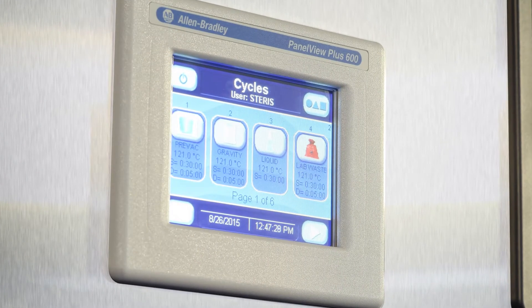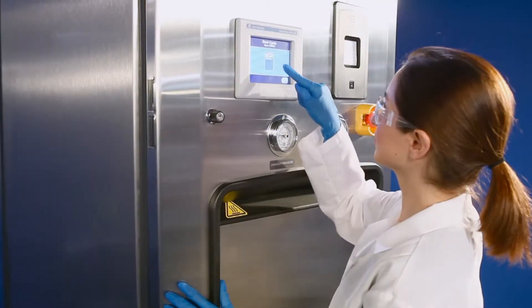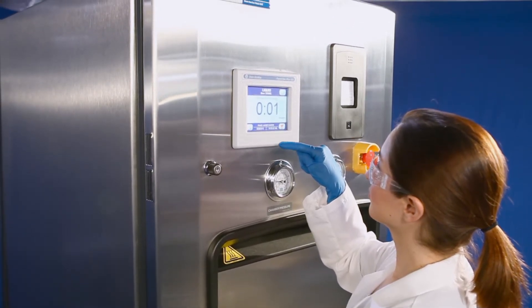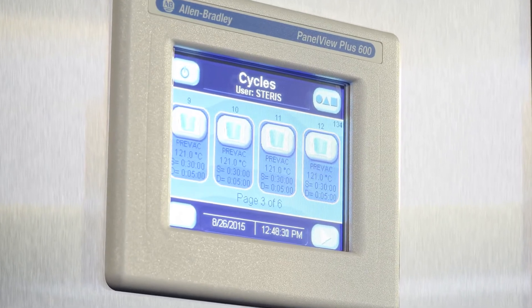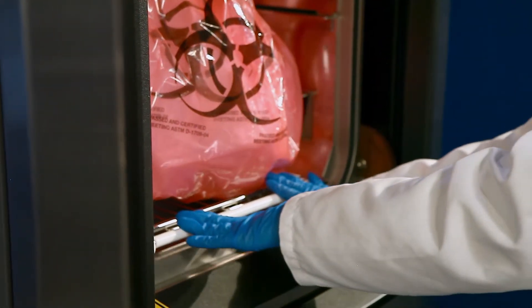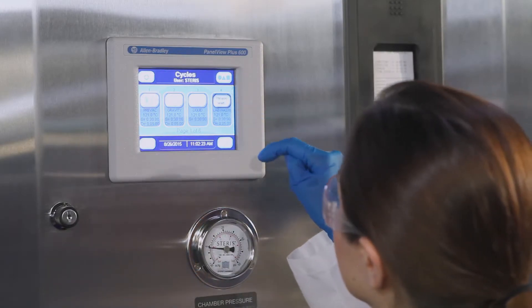Today's research facilities require flexibility to manage a variety of demands. The Allen-Bradley control is simple and easy to understand for the basic operator, yet allows maximum programming flexibility to process any challenging load. The AMSCO 110LS and 250LS also include pre-programmed cycles, including a new cycle designed to efficiently process laboratory waste bags, which are challenging to process without long cycles.